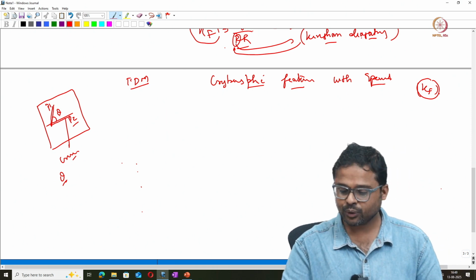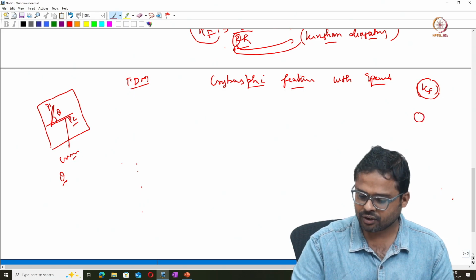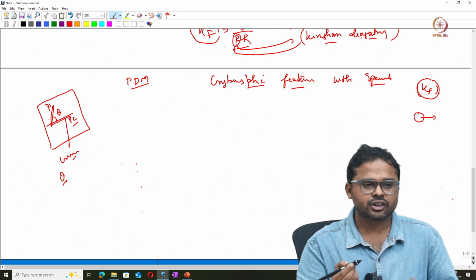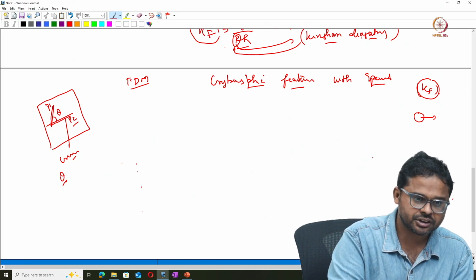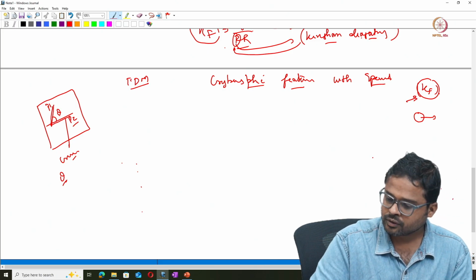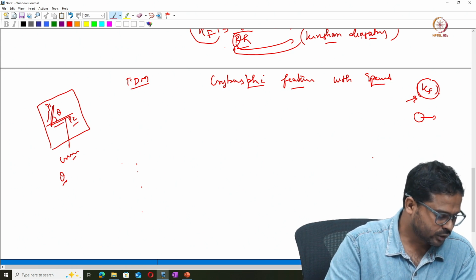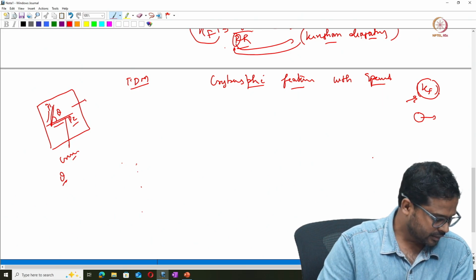In the last class, I showed you an example of how the spherical morphology of the precipitates can be used to estimate the kf value, the field factor. Similarly, we can use the angle between any of the crystallographic planes or the crystallographic precipitates or phases, which is a constant that doesn't change, to calibrate the kf value. Okay, so once these planes are identified, the spacing between these planes also can be calibrated in the depth dimension. So this is one way of doing the calibration.